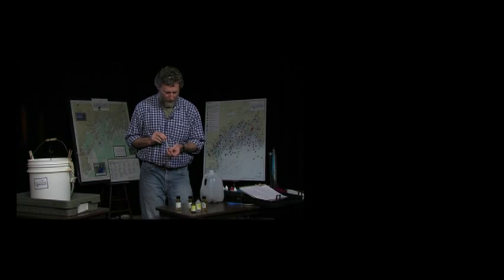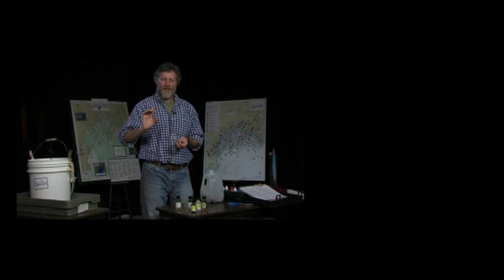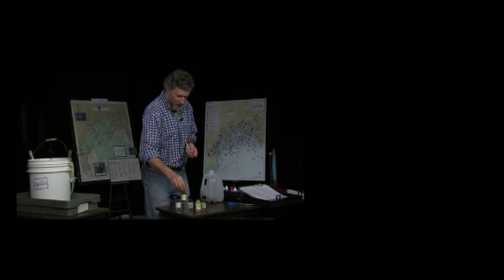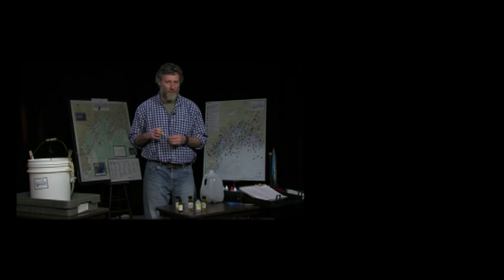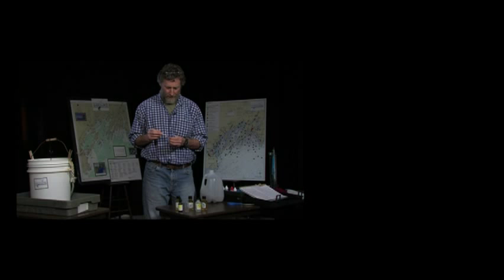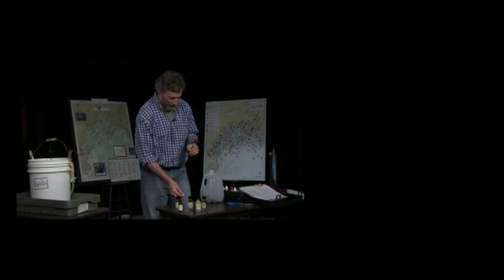The thiosulfate, when we add it to our sample, will eventually make the yellow sample slowly become a clear sample. At some point, it will be very difficult to tell whether it's clear or not. So we add some starch to the sample, which will turn it a purplish color. Then we can continue to add thiosulfate, and eventually it will turn over to clear, and then we'll know what the measurement is. We'll read off of the syringe, and that will tell us how many milligrams per liter of oxygen there is in the sample.